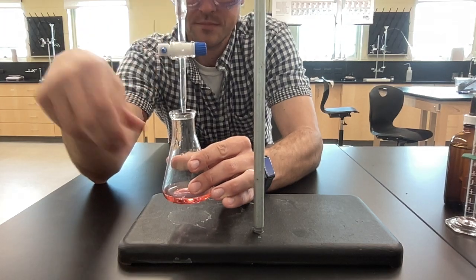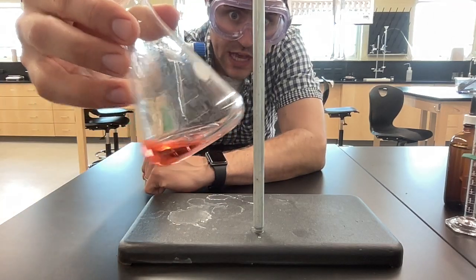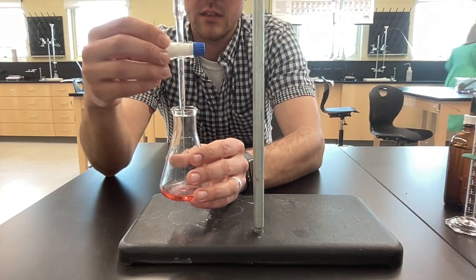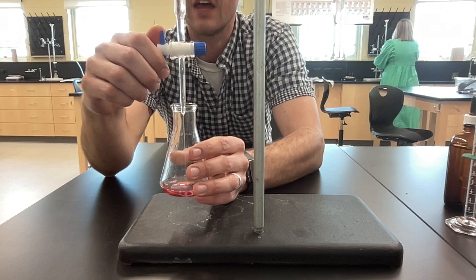Still red. I'm looking at it, still red. It's hardly even yellow yet. This thing is clearly still acidic. Let's go crazy and add 3 more milliliters. I know, we're moving fast. That's okay. I think I know what's going to happen.